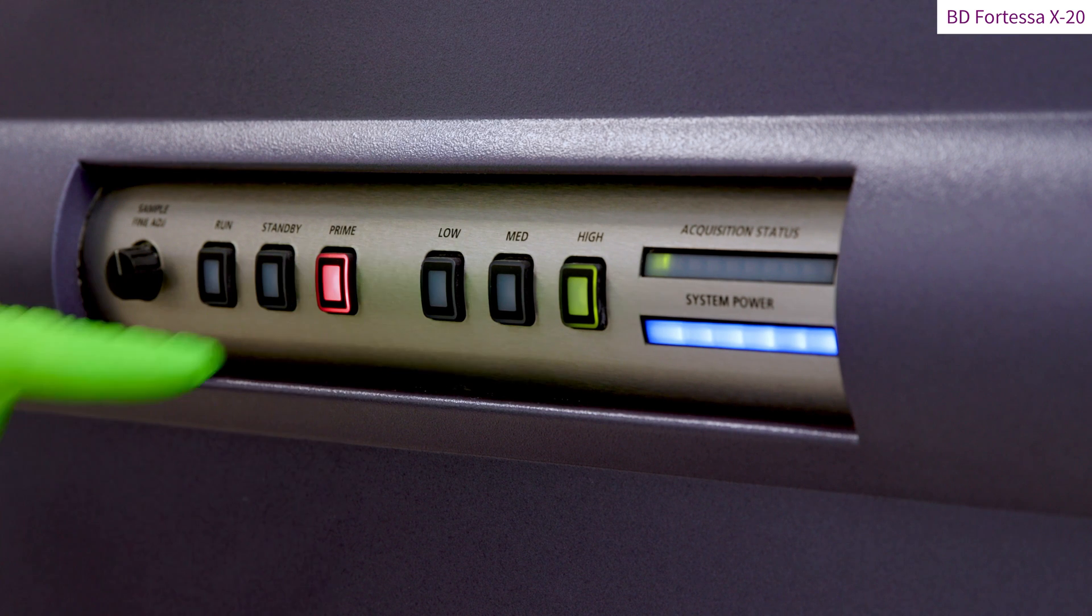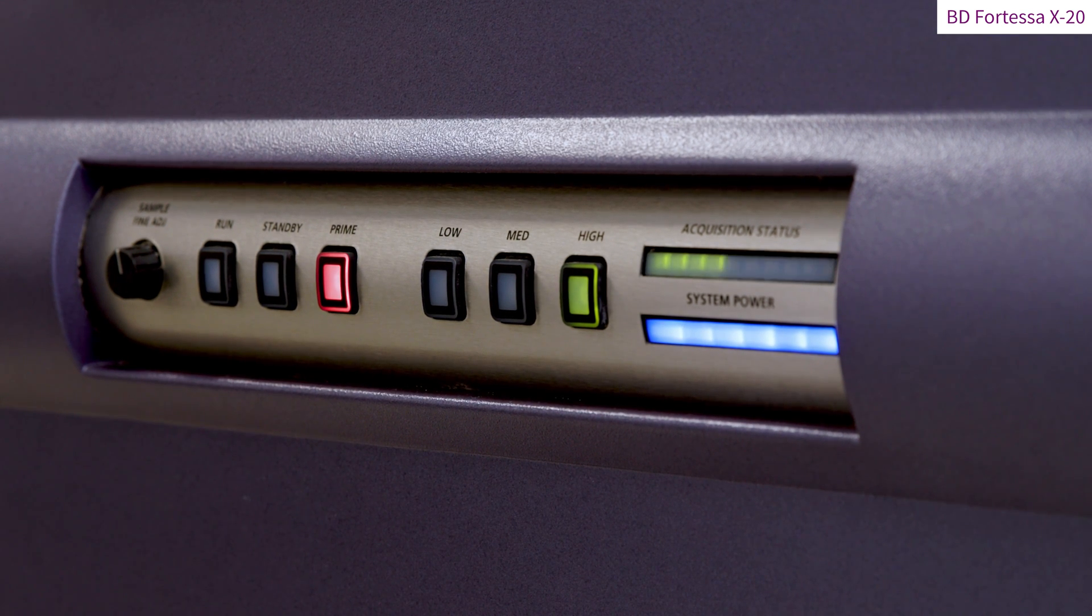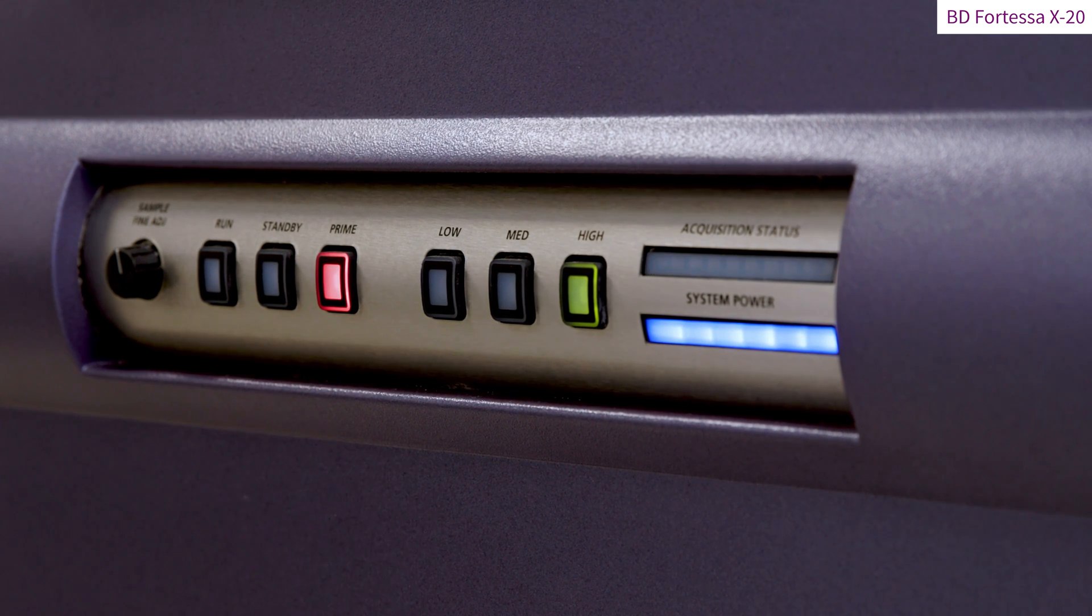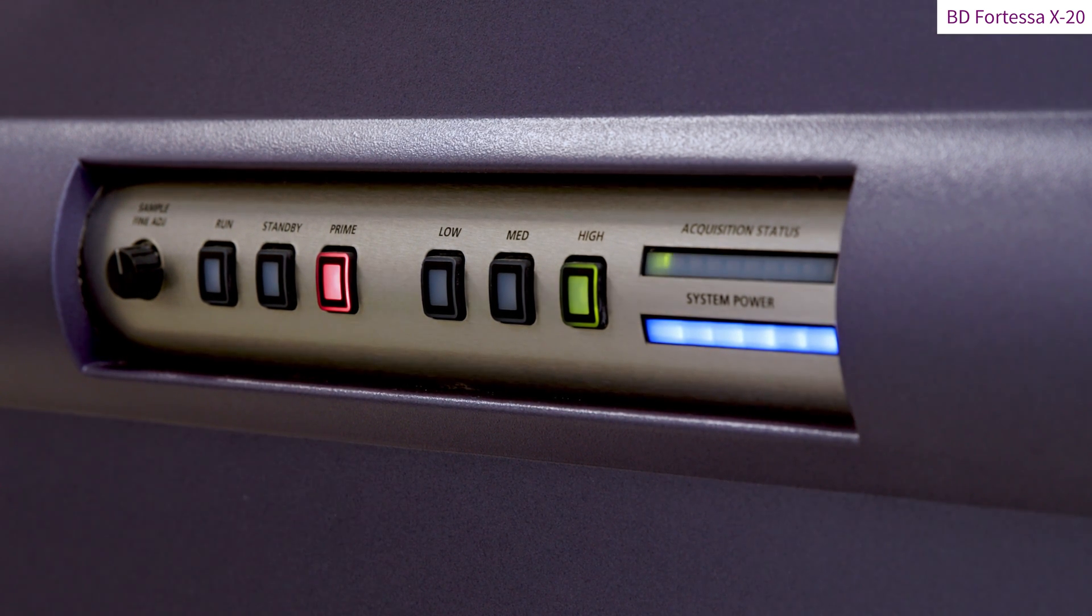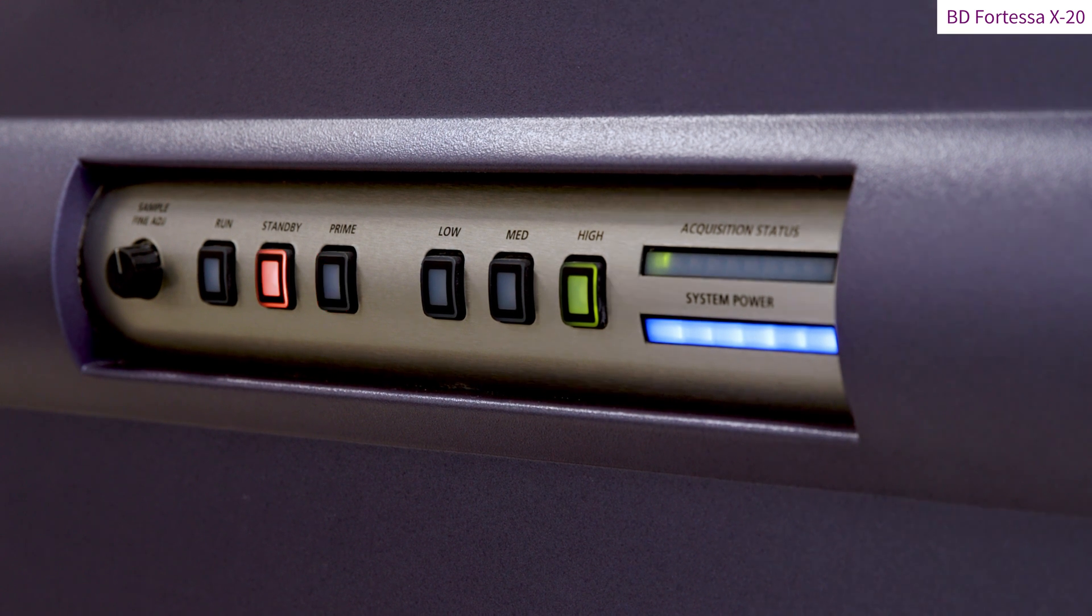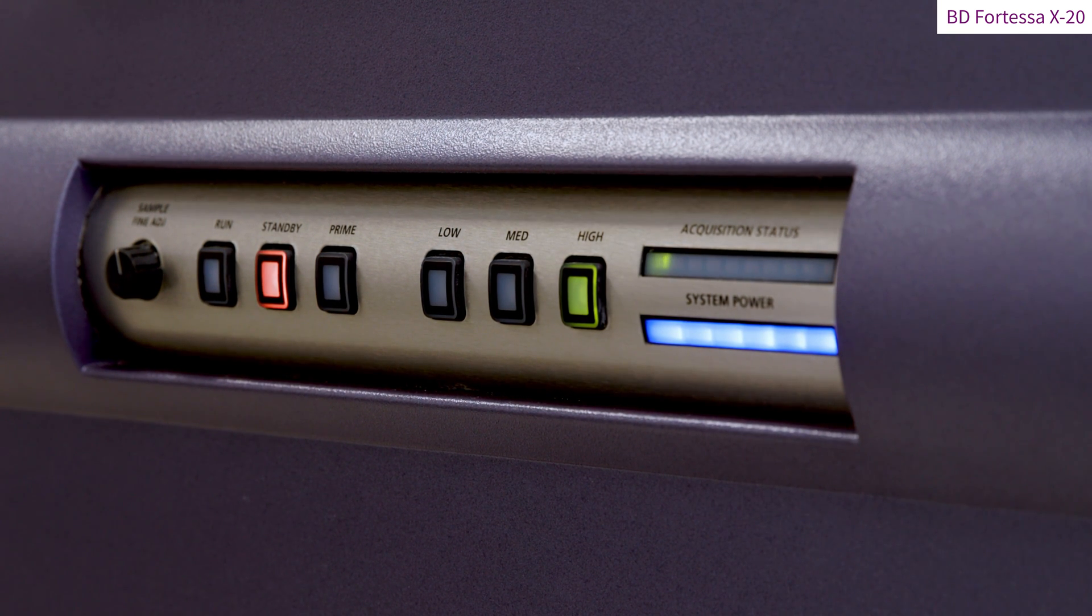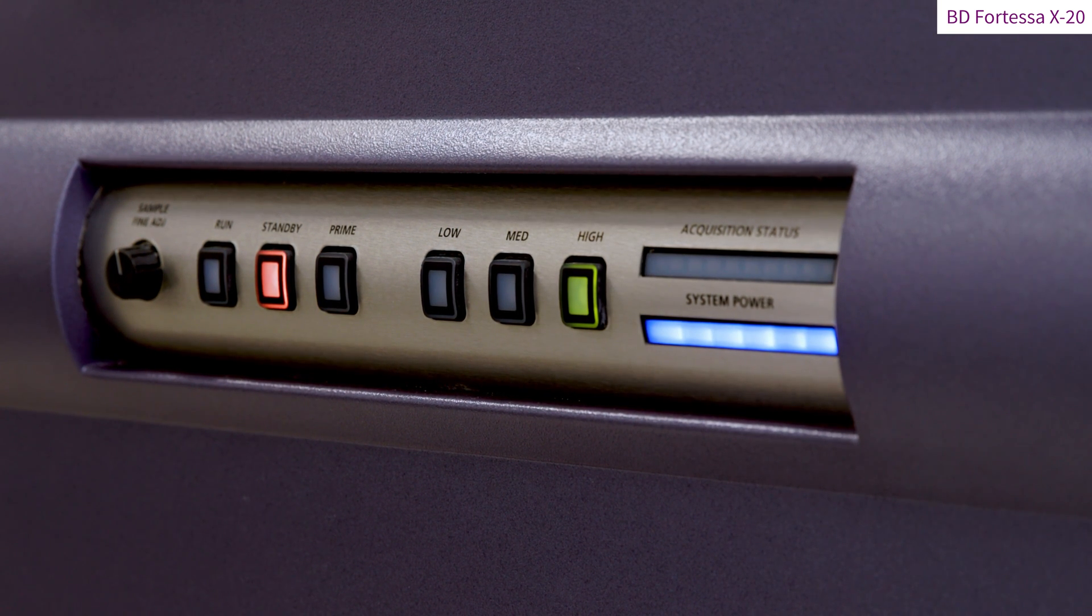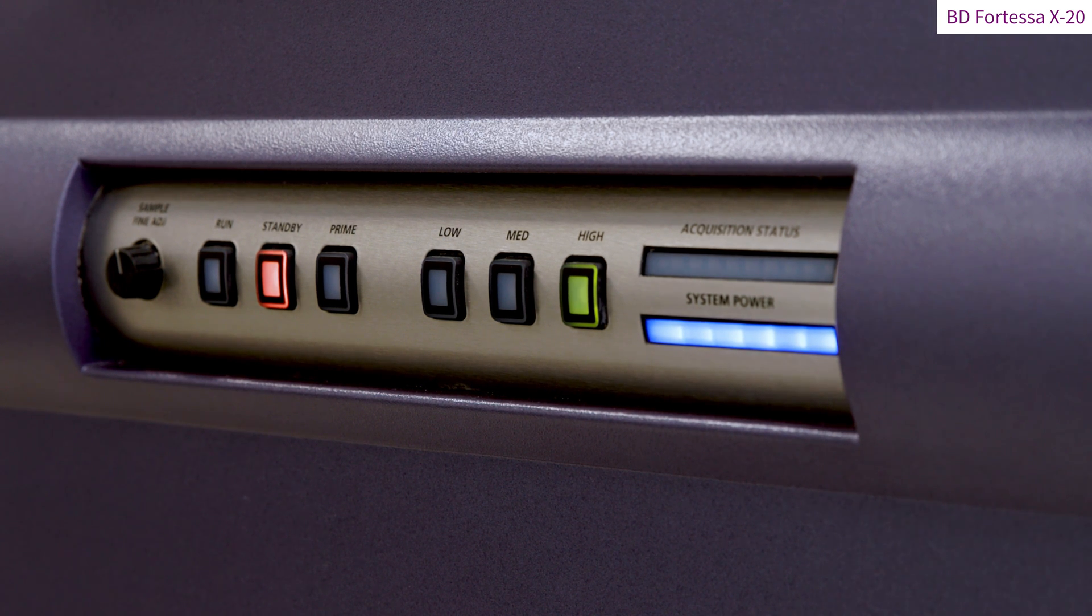In case of a clog, priming the flow cell by the prime button is an excellent way to try and remove the clog as a first attempt. Once the priming is done, the Fortessa will automatically go back to the standby mode as shown by the amber light.